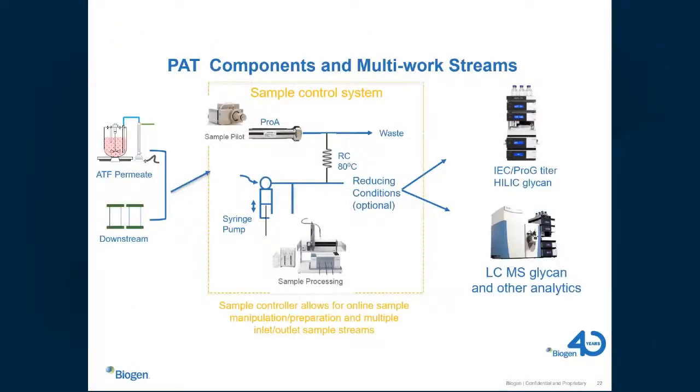So this was, again, just giving you a snapshot of some of the things where mass spec has come in, particularly as we move to other areas, maybe continuous manufacturing and so on, where I feel this is even more critical. Using the right kind of sampling through a number of sterile ports you can get, having sample processing there if you need reducing conditions or not.